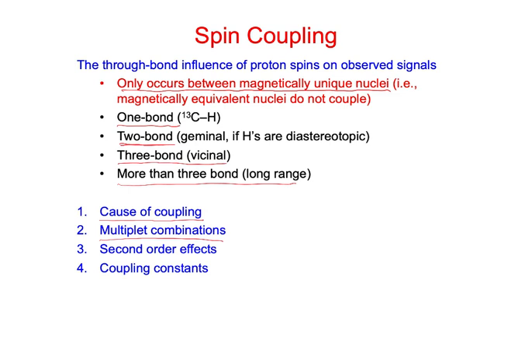And so these are all going to be kind of what we could say the ideal situations, which we don't always see in real spectra. Okay, so then we're going to go on and talk about second-order effects. So these effects can distort the coupling patterns from ideal. And then we'll talk about the different types and magnitudes of the coupling constants. Okay? So let's just start into the first one here.